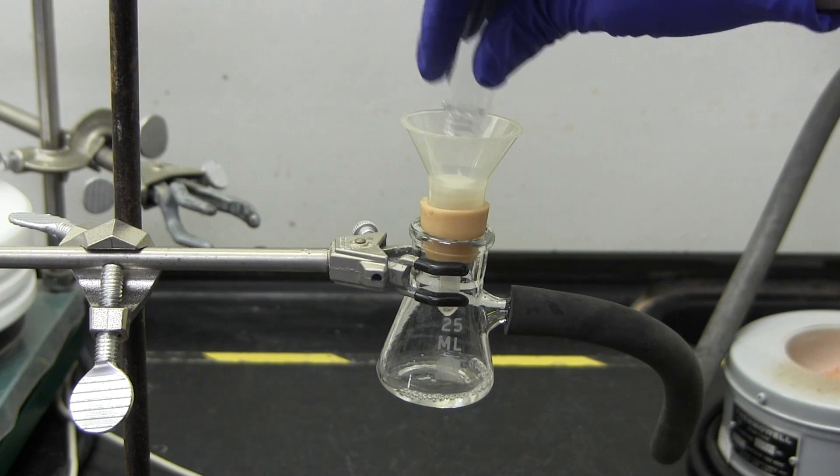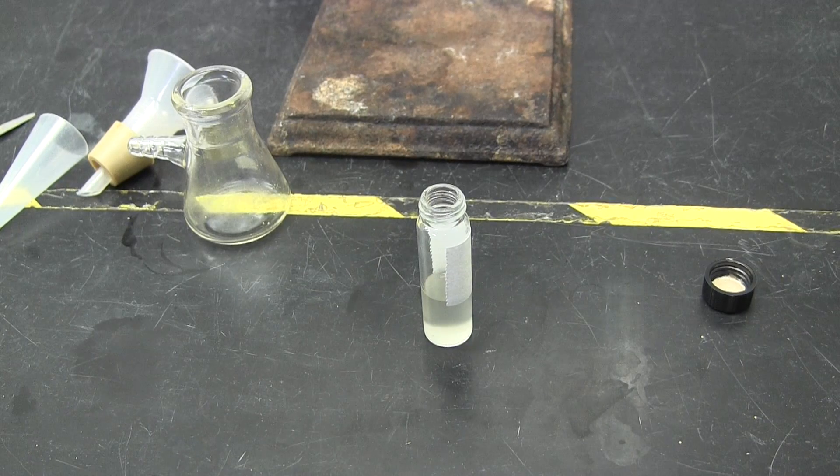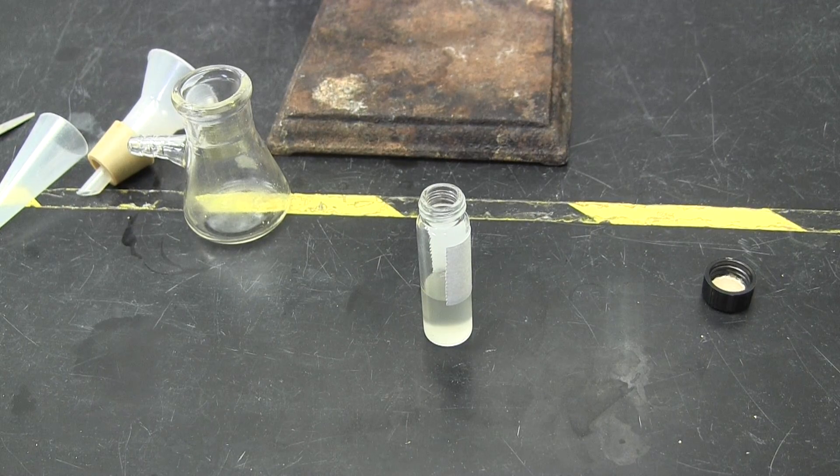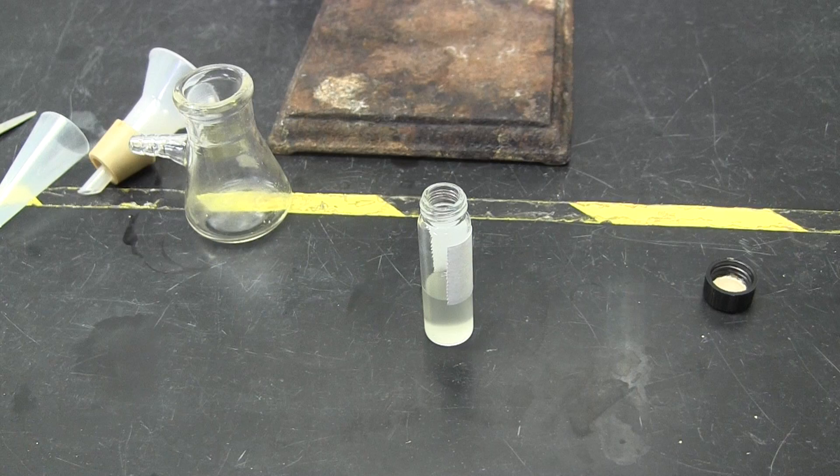First you will filter off the enzyme. Label the vial with your name, the date, lab, and lab period. Cap the vial and tape it inside your drawer.